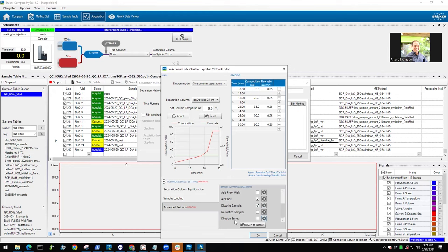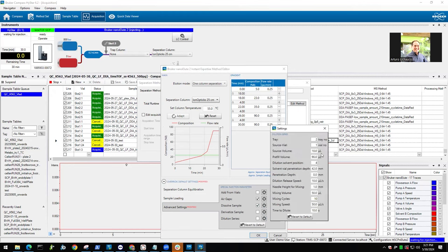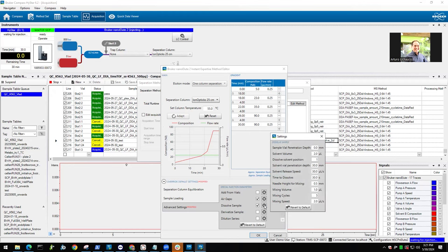Yeah. So how this looks is you have to define in which tray position, which vial it is, where you want to transfer it, and what the dilution could be. So you have to change a couple of settings. And for the dissolve, we have to define the solvent volume that we want to inject. And for 384 well plates, I typically use 2 microliters because then the volume is large enough to basically do the mixing as well. You define from which vial from the wash station you want to take it.